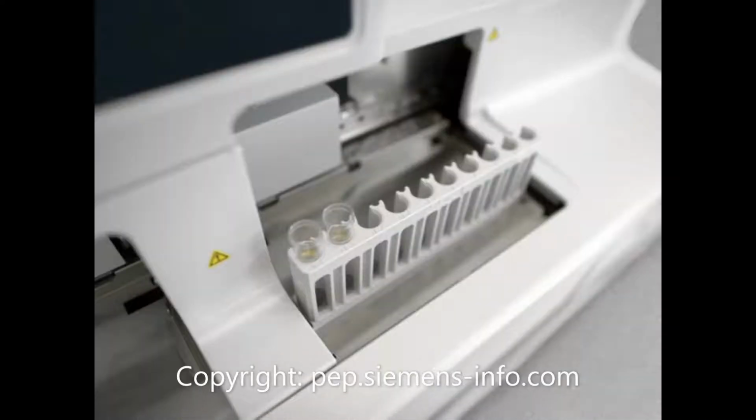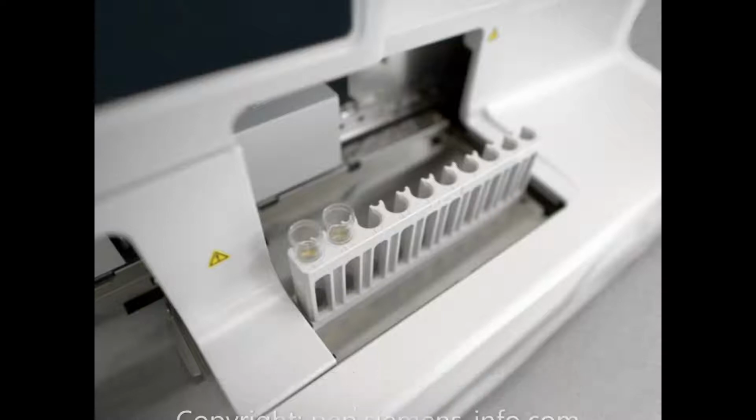Now that the cups are loaded on the rack, place it onto the loading bay, ensuring it is properly seated to avoid a jam. Now that the rack is facing away from you, cup number 1 is on the left and is the first one the analyzer will use for the QC job.